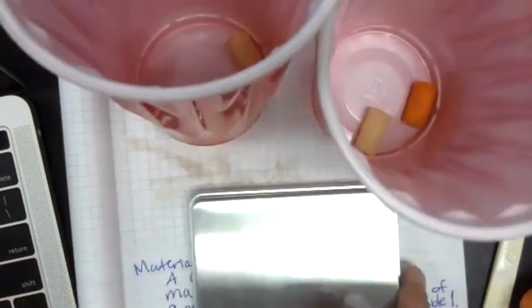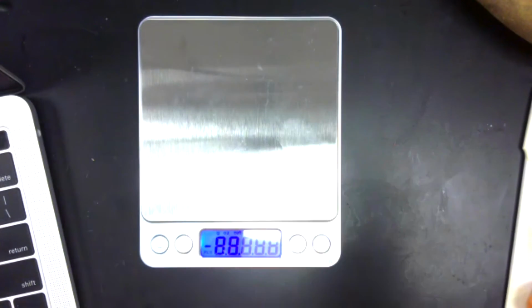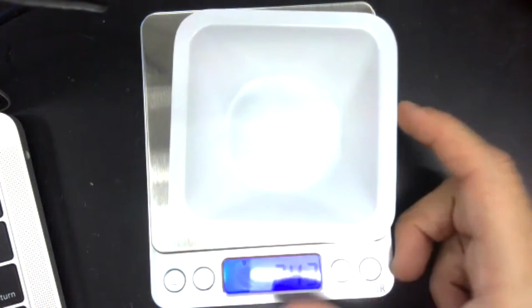All right, so I should make sure that's on a flat surface. And I am going to turn my scale on here. You should use a weigh boat, so I'm going to do that. That's why I don't ever clean off my desk, because everything is right here. No, I'm kidding. I really need to clean off my desk.